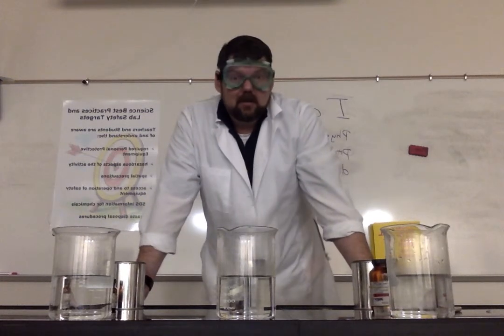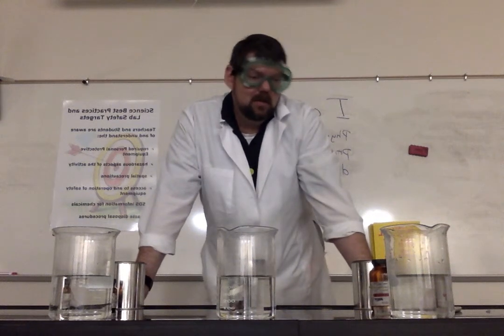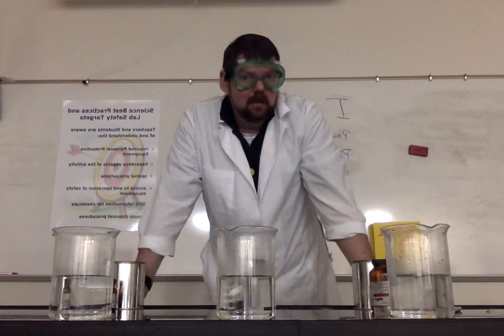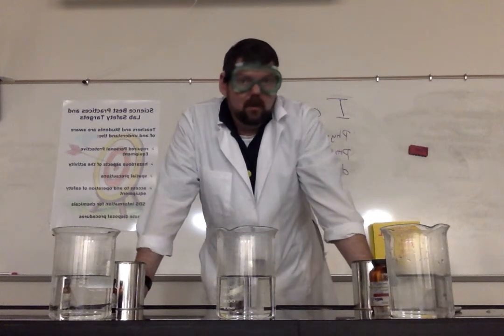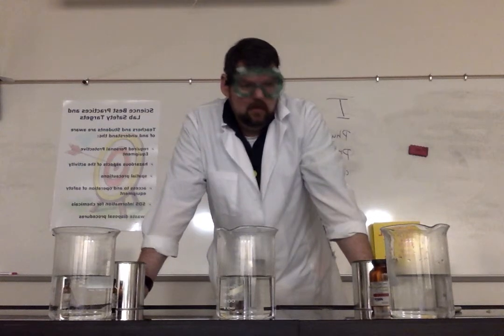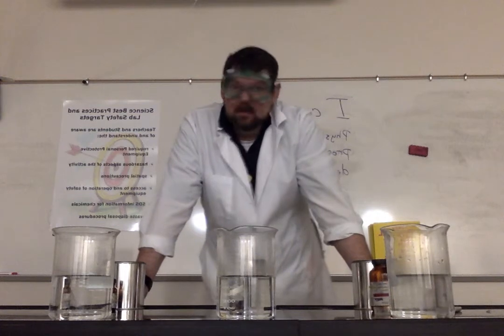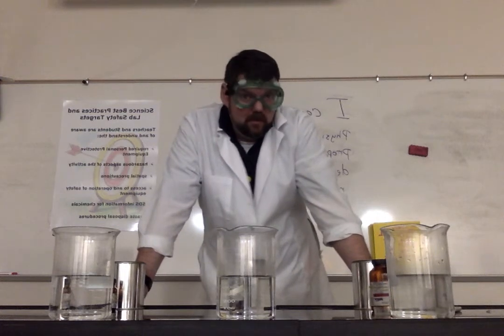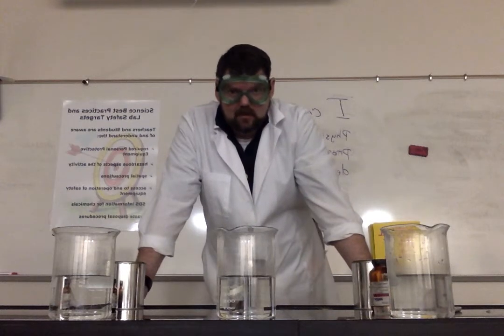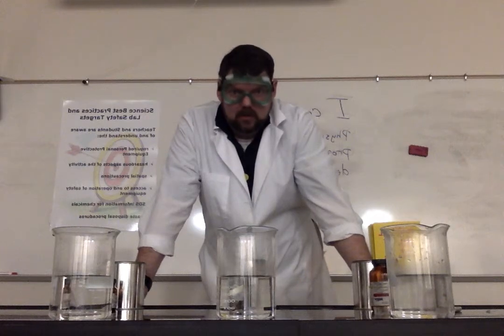With the gas coming, we have the bubbles, which let us know that gas is actually being produced. It lets us know there's a chemical reaction occurring. This lets us know that the chemical property of lithium reacting with water is actually occurring. So we don't have any kind of color change, but we see that it's disappearing. This isn't dissolving. This is totally different than if I put sugar into water. Instead, this is a reaction, and with the reaction, I'm getting a totally new substance.